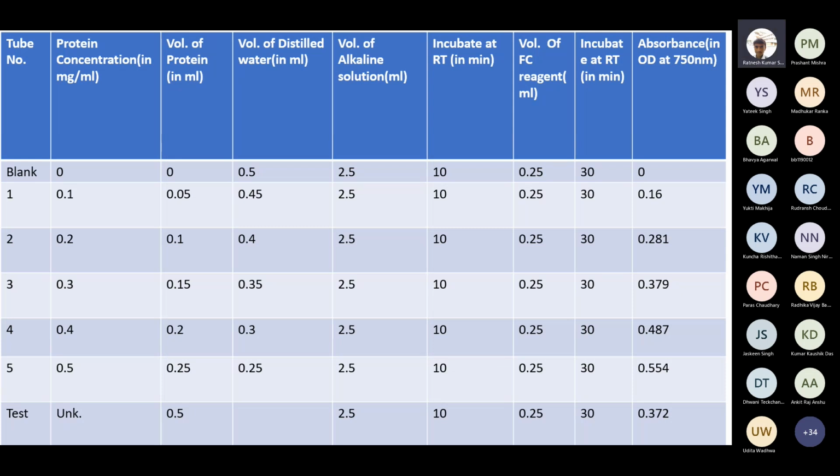I have a question. Yes, please ask. Ma'am, did you add Folin's reagent in the blank sample also? Yes, I measured the blank, and Folin's reagent was also added. You can see it is written here in the blank also in this table itself.